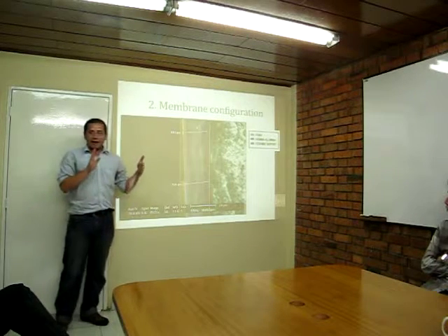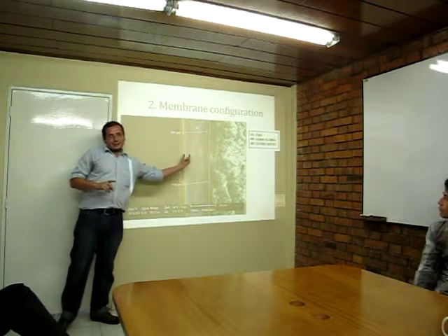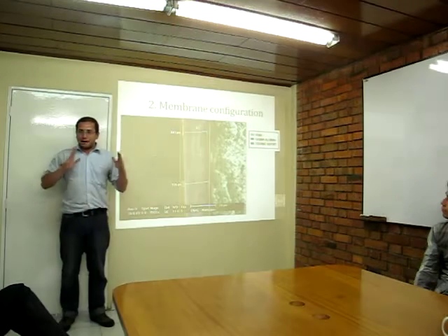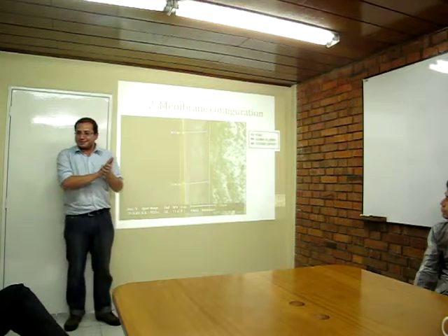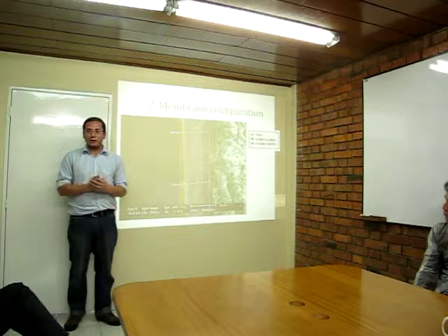Gets bigger. And if you don't put this layer of gamma alumina, it expands in the ceramic support, with water or ethanol, with the two components.